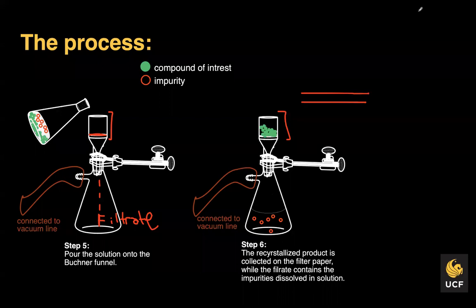Okay, and then in any experiment that we run, we typically want to characterize the final product that we get. Was it pure? Was it impure? Did we get what we expected? Could we run an NMR? Are we looking at different reactions, different functional groups appearing and disappearing, right? We could simply run a quick IR. NMR is always one way to assess the purity of something, but for us, melting point analysis is a quick way to assess the purity of the compound, right? And typically, if it's narrow and within 5 degrees, you could say that the compound is pure.